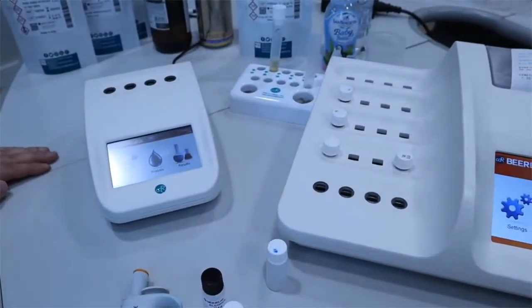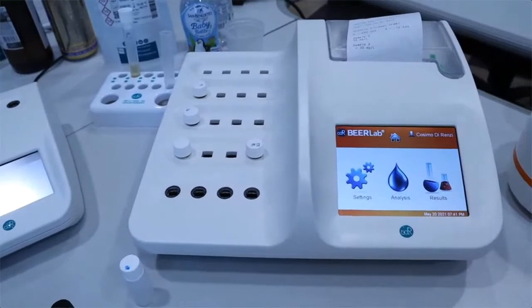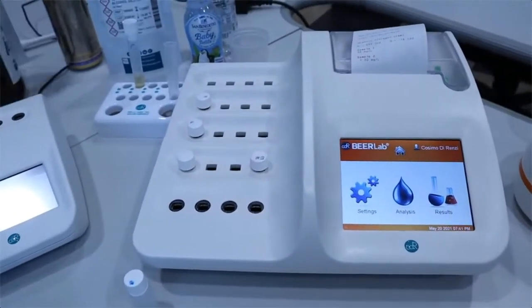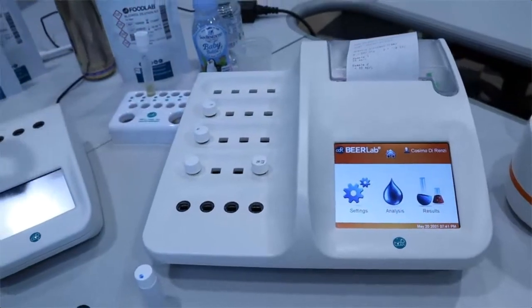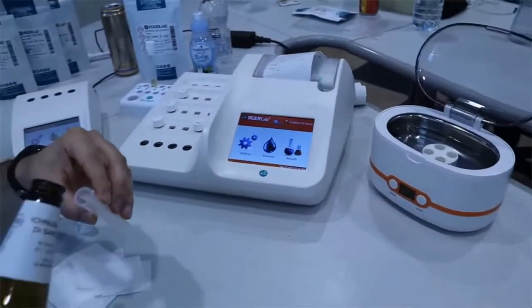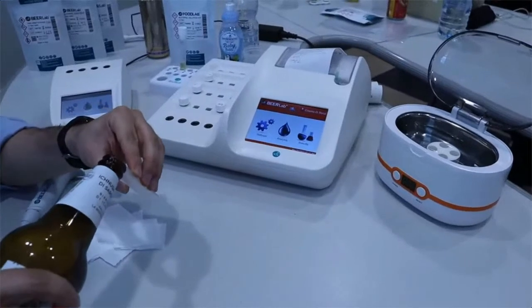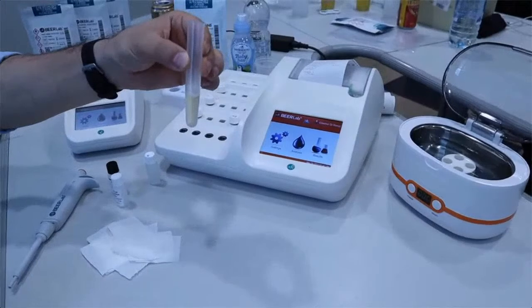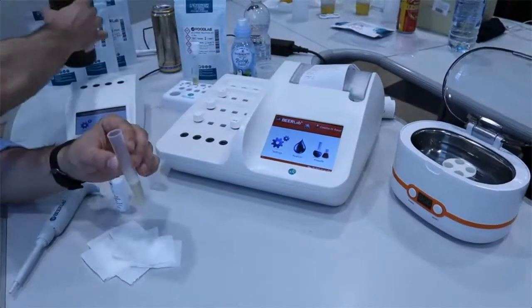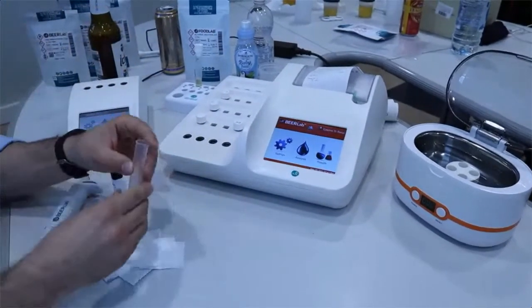Okay, the first thing we have to do is to degas the beer, and here we can take a bottle of beer. Just a little beer like this is more than enough to run all the analysis you want.